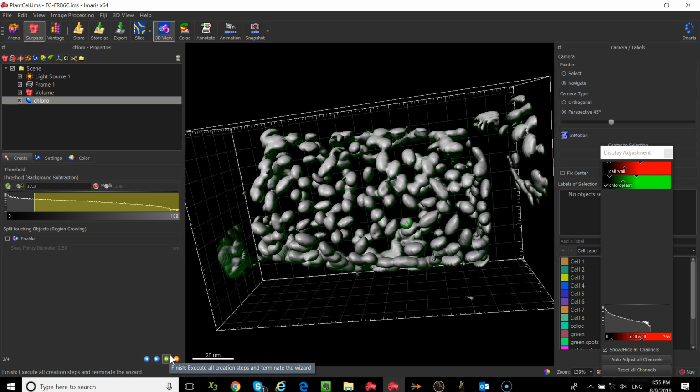Okay. How do you exit from the slice view? So you just click on the 3D view. Oh, 3D. Yes. So it's basically just a different view. So if you click on slice, just click back on 3D. 3D view is that work area for your 3D rendering. Thanks. Okay. So if everyone's done this, I'm actually going to ask you to do something a little different.